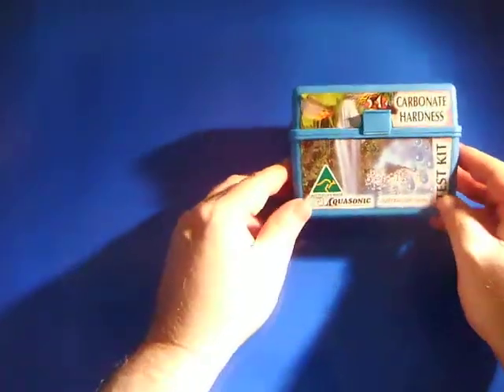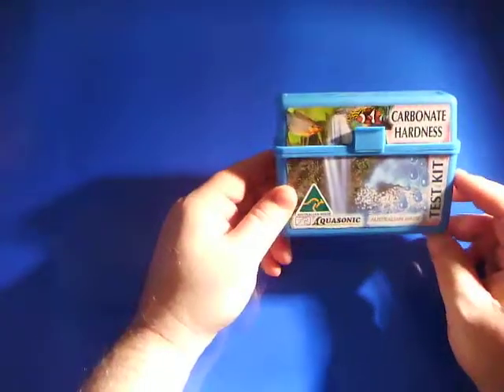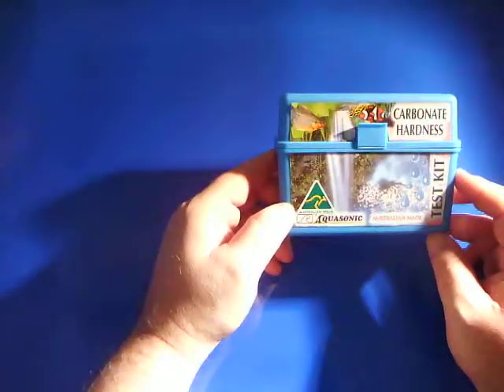Here we have the Aquasonics Carbonate Hardness Test Kit, and as with pretty well much all of Aquasonics Test Kits, they come in a heavy duty plastic container. They are Australian made, and Aquasonics is well known within the industry.